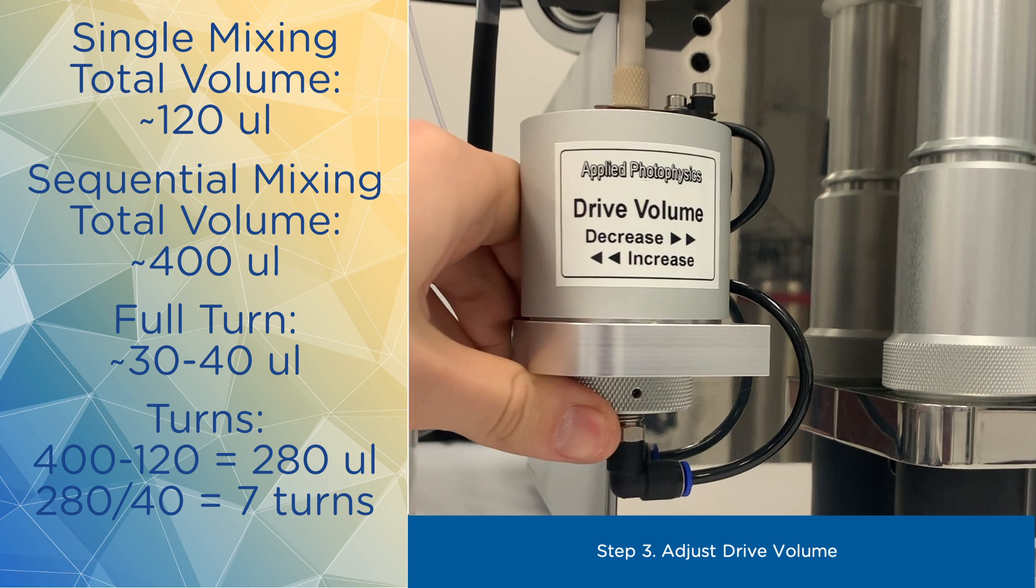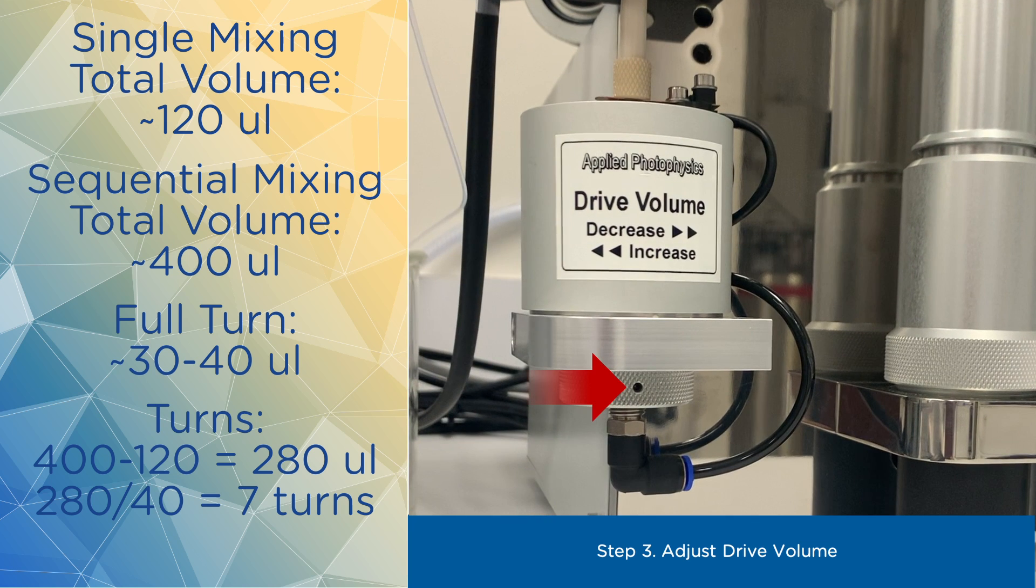This means that in order to increase the volume to 400 microliters or by 280 microliters, you need to turn this adjuster about 7 times. The easiest way to keep track is to pay attention to this grub screw hole. We genuinely don't have a better name for it.